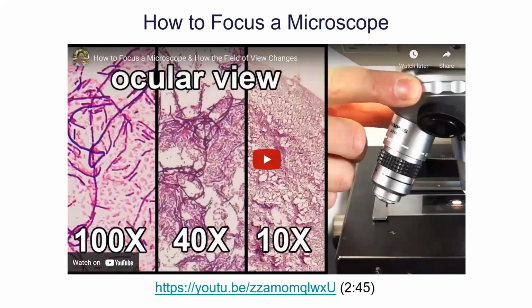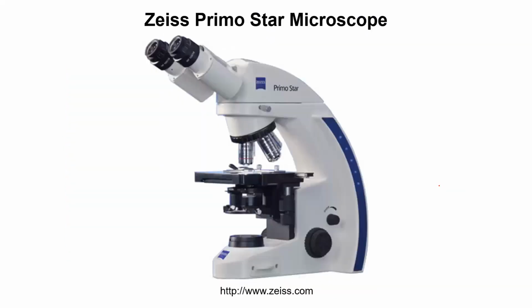So I guess we already looked at this video. I'm just going to keep moving on, and there's our microscope there. And just to point out a couple of things, most people have probably found these. This is a diaphragm there at the bottom that can control how much light goes through the specimen. The stage adjust knobs are right there. They're not really shown very well in that picture. And of course, these are the ocular lenses, and these are the objective lenses. So I think most people have gotten reasonably familiar with those, and we'll get a chance to use them a couple more times this semester.